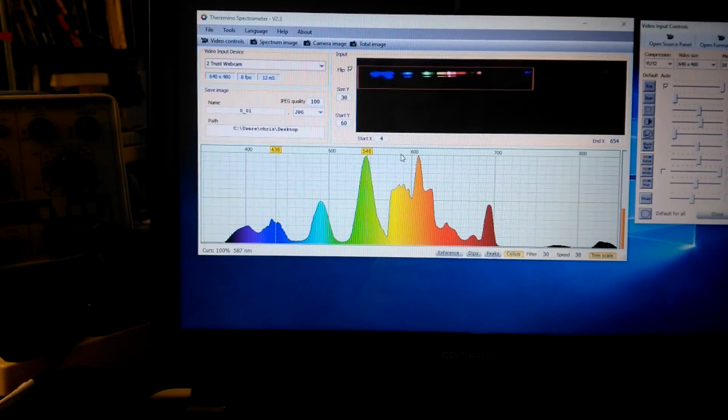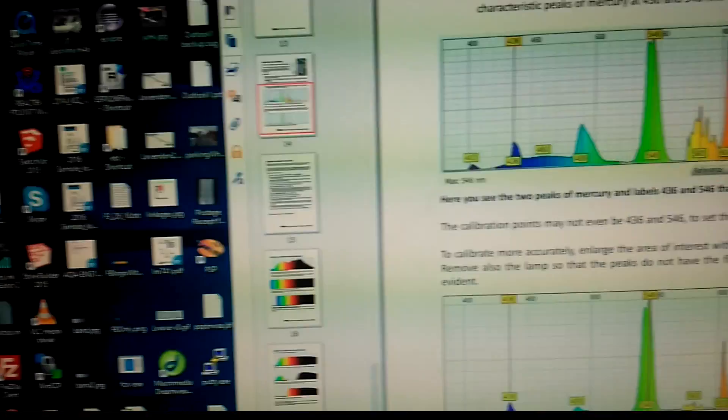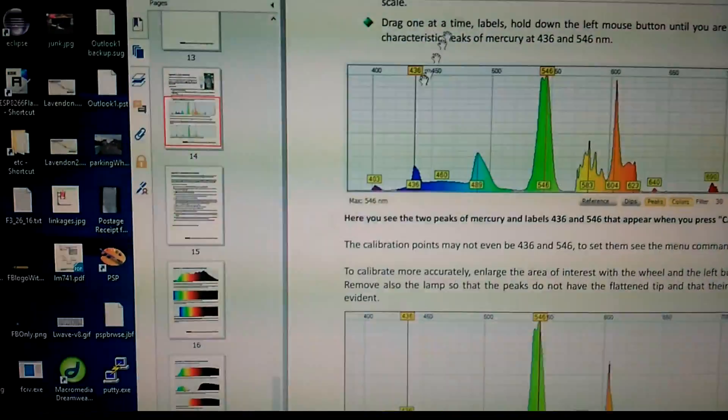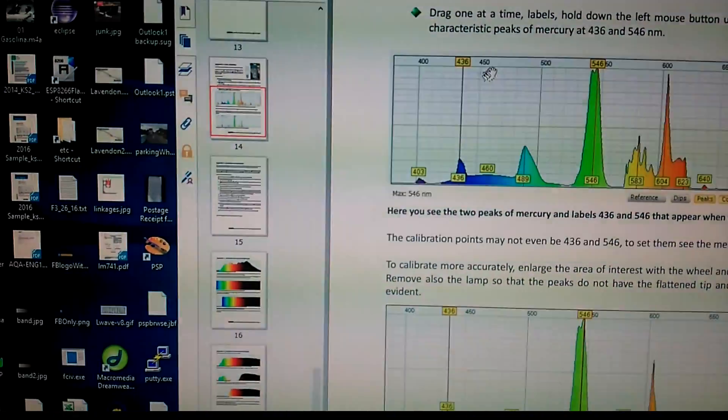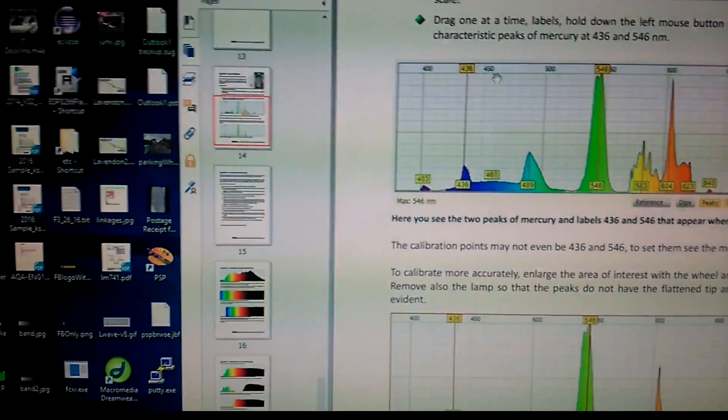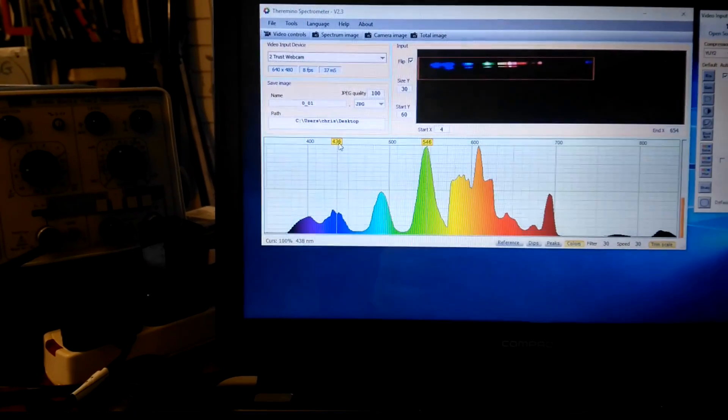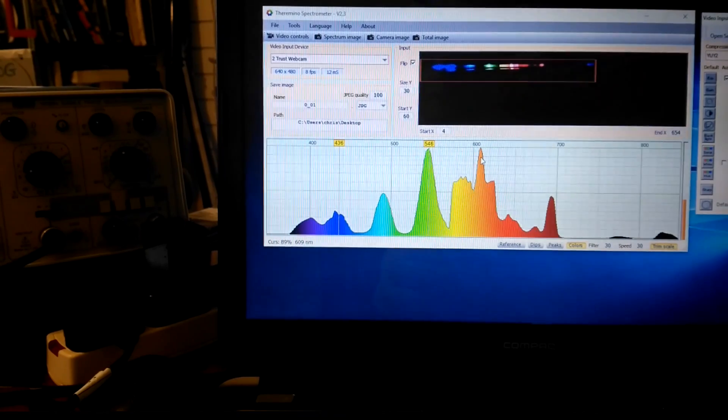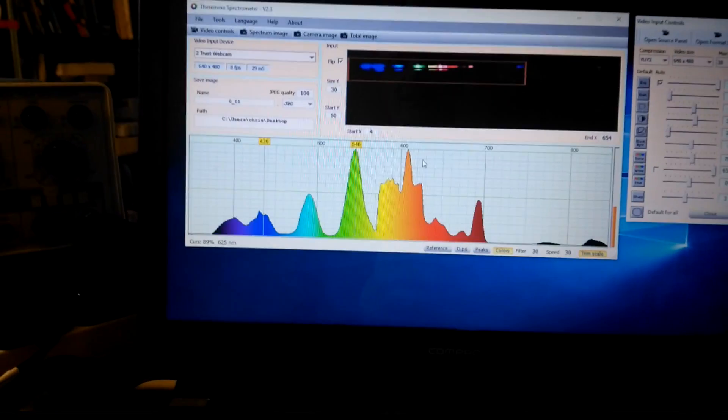And then there's another characteristic line at 463—sorry, 436—here. So we need to pull this. Oh look, that's already on it as well.